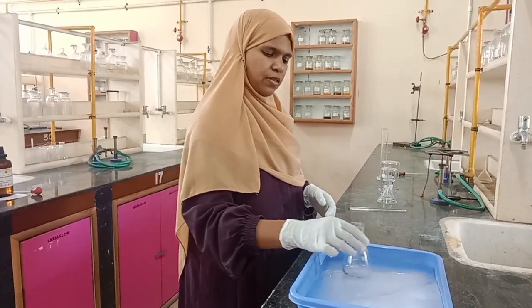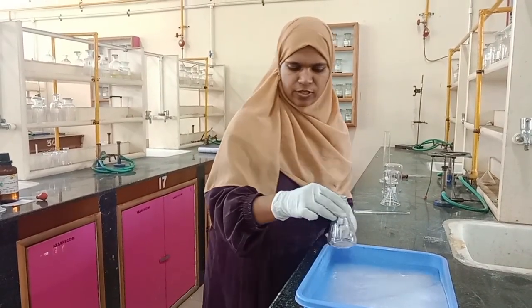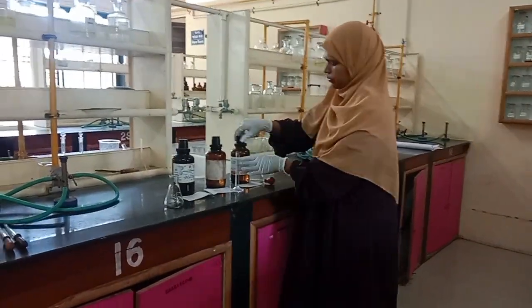Okay. Now we add 2 ml of concentrated HNO3 in this conical flask. Let's go.